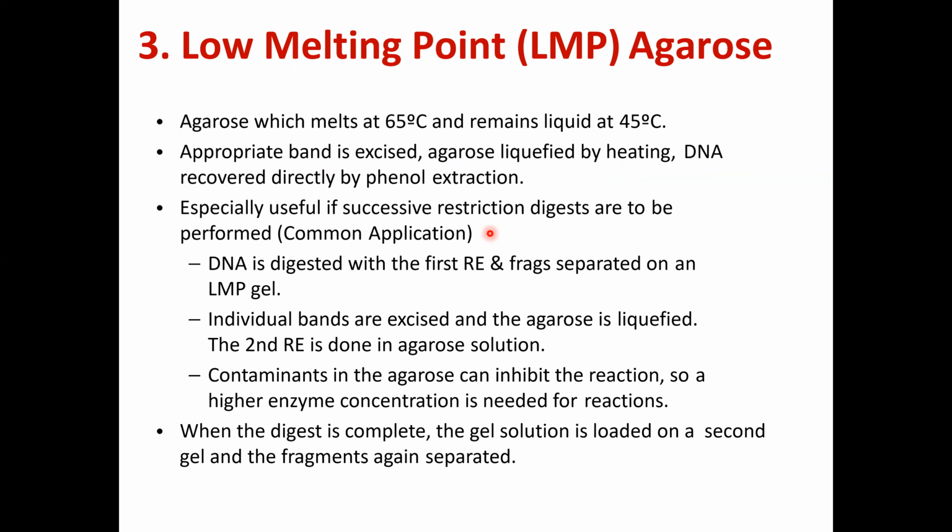This is especially useful if a successive restriction digest will be performed, and it is a very common application in the laboratory. So if your DNA is digested with the first enzyme and the fragments are separated on the LMP gel, then the individual bands are excised and the agarose is liquefied.